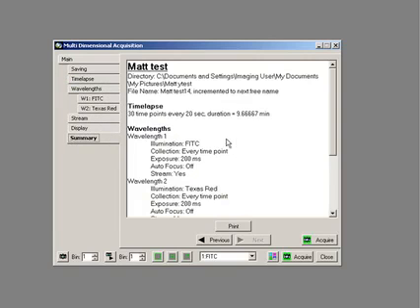Under display, or summary, we can see that my experiment is designed to stream through red as quickly as possible through a Z section, green through the Z section, then it's going to wait, and then it's going to do the same again twice.